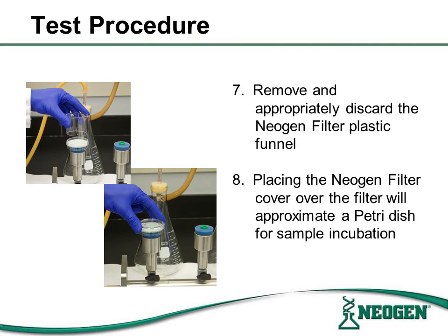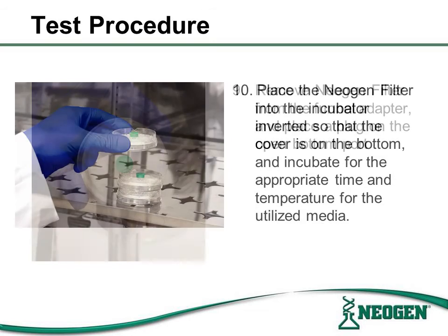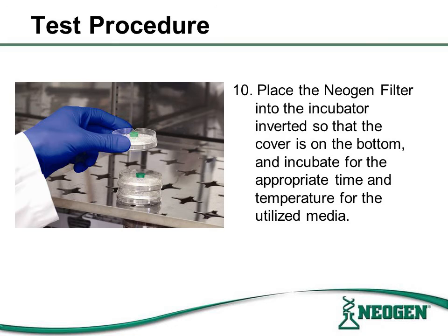Remove and appropriately discard the Neogen filter plastic funnel, or sidewalls. Once the sidewall of the filter apparatus has been removed, place the filter apparatus cover over the filter for incubation. Remove the covered filter from the funnel adapter and place a plug on the open bottom port. Place the Neogen filter into the incubator, inverted, and incubate for the appropriate time and temperature for the media utilized.